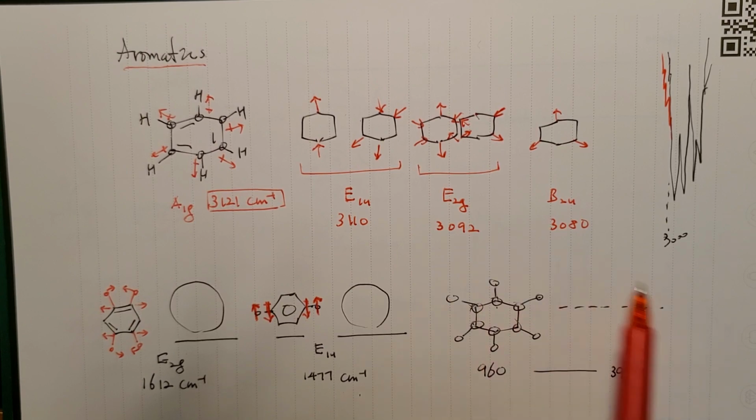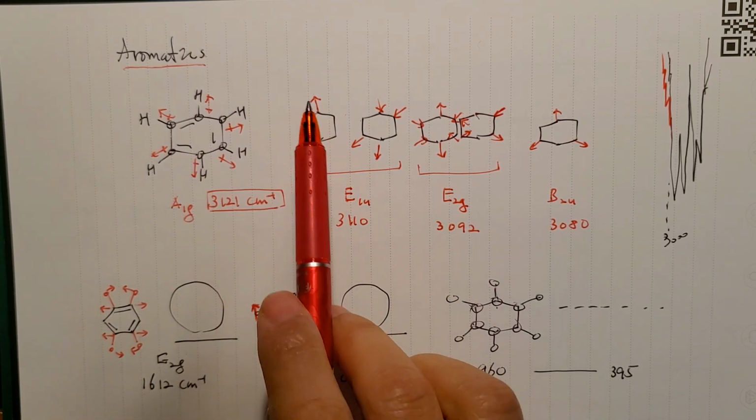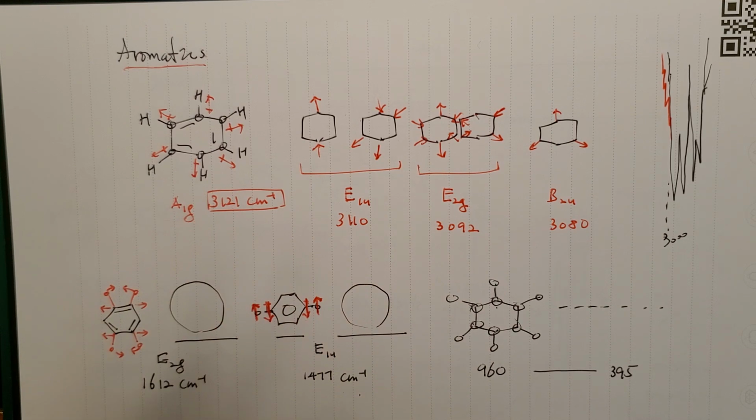But now you have a bending vibration mode of the ring, not just the hydrogens here, like you saw. Also, these are the stretching. I'm sorry. So here, all the bendings.